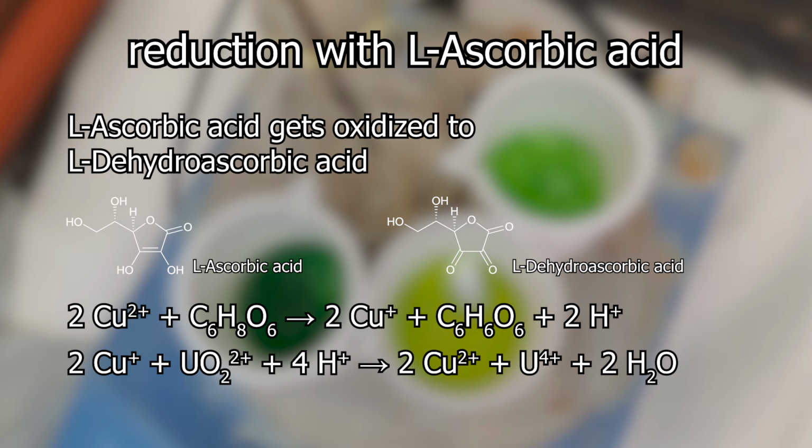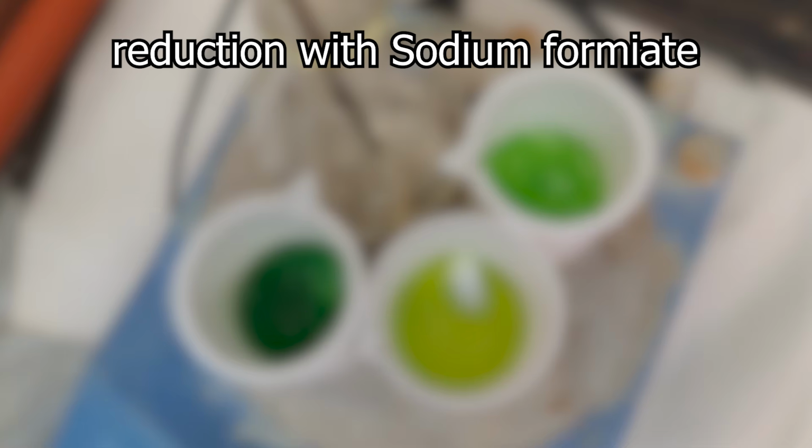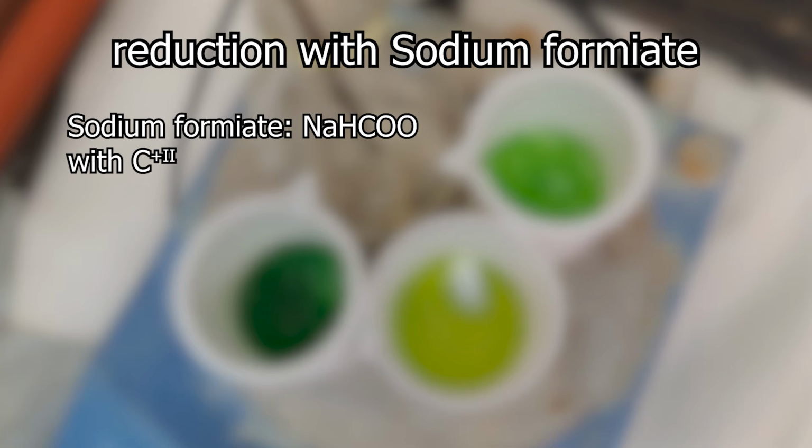So you could also first dissolve the copper in hydrochloric acid and then reduce it with L-ascorbic acid and then add the uranium later. That would result in several beautiful color changes. With the sodium formate, absolutely nothing happened. Why should anything happen here at all?